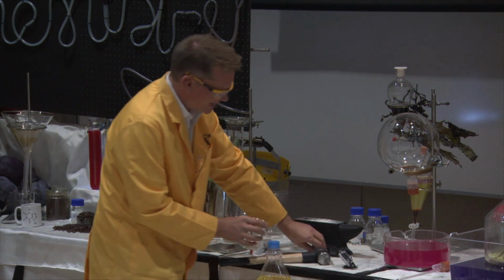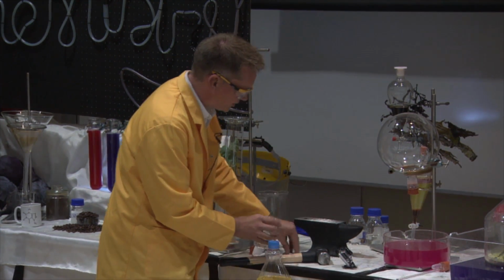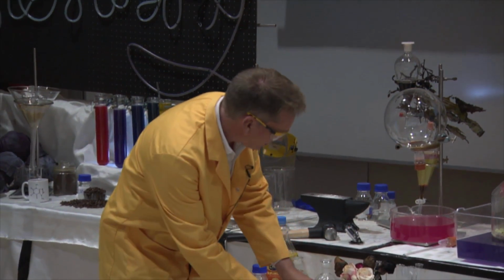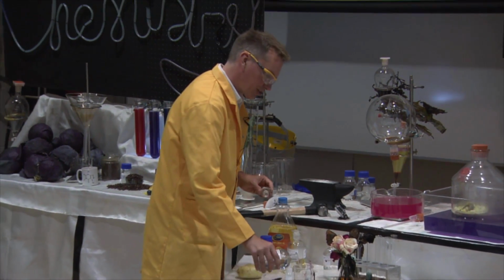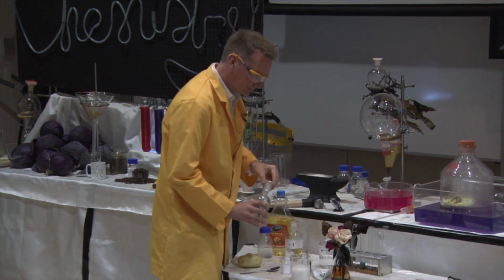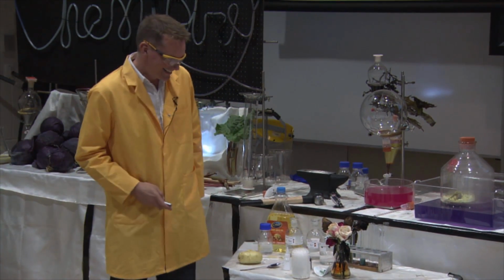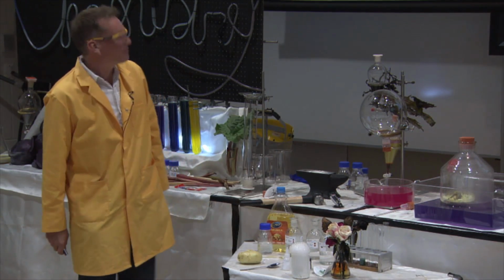So if this really is a carbonate, again, it should react with an acid to give bubbles of carbon dioxide. Well, let's see if it works, shall we? I'm going to use a different acid, this time nitric acid. So adding this to our shells, well, certainly very bubbly. Oh, very, very bubbly. Oops, extremely bubbly. And it's bubbling over the top, never mind.